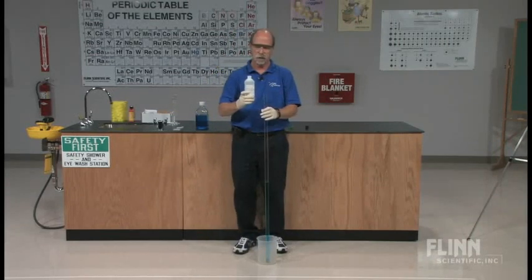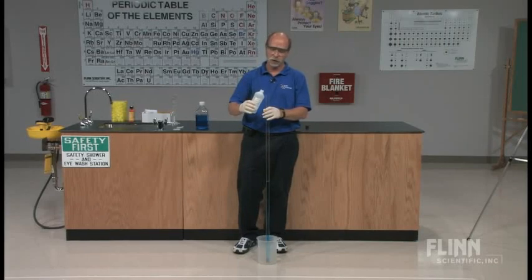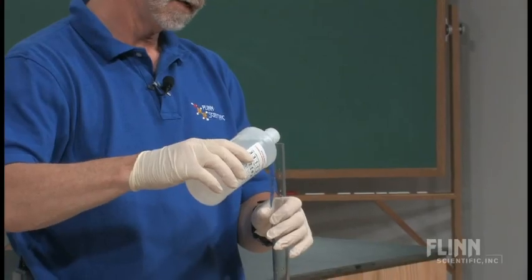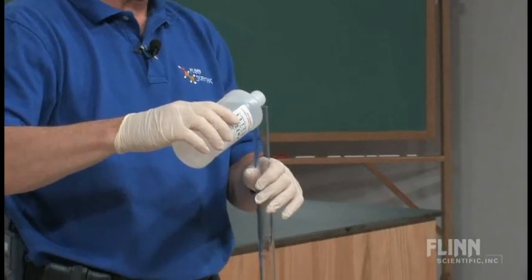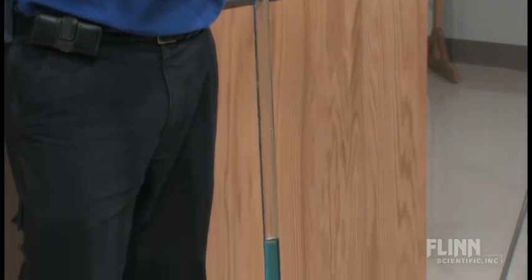And this is absolute alcohol or anhydrous alcohol. It is denatured. I'm going to add this slowly at first because I want to reduce the amount of mixing of the two.